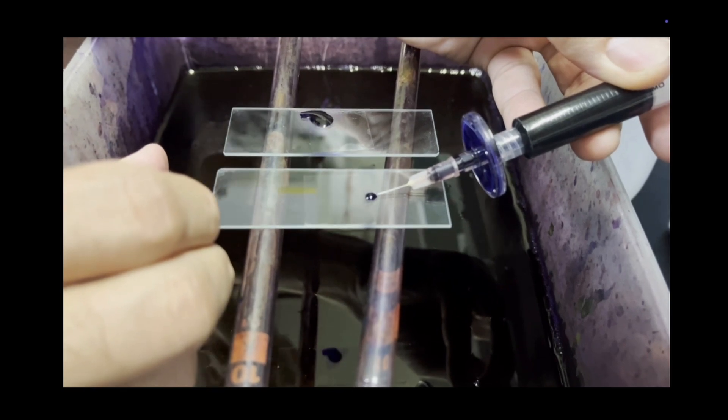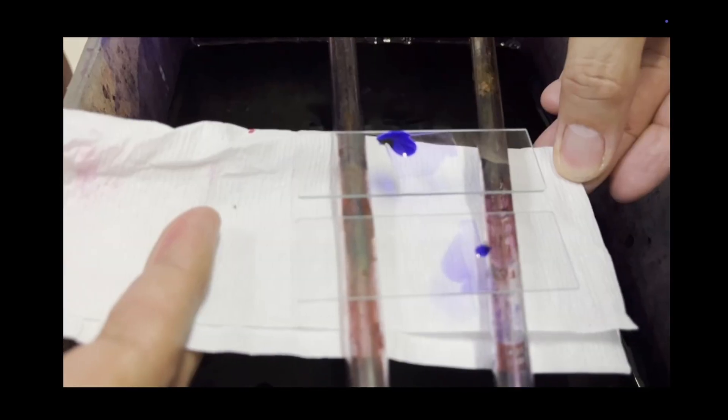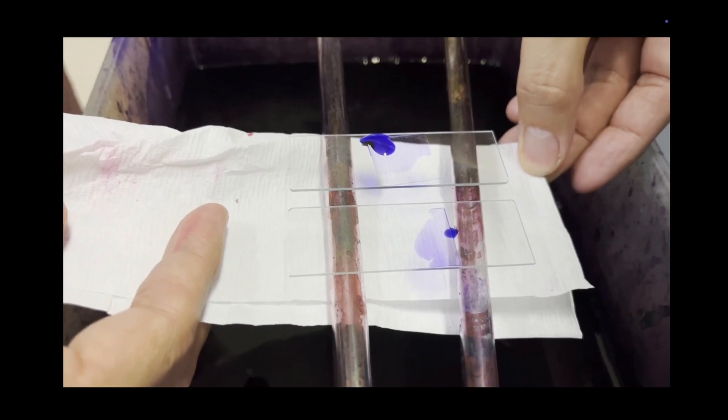Slowly at the edge of the cover slip you can see the stain slowly spreading through the cover slip.